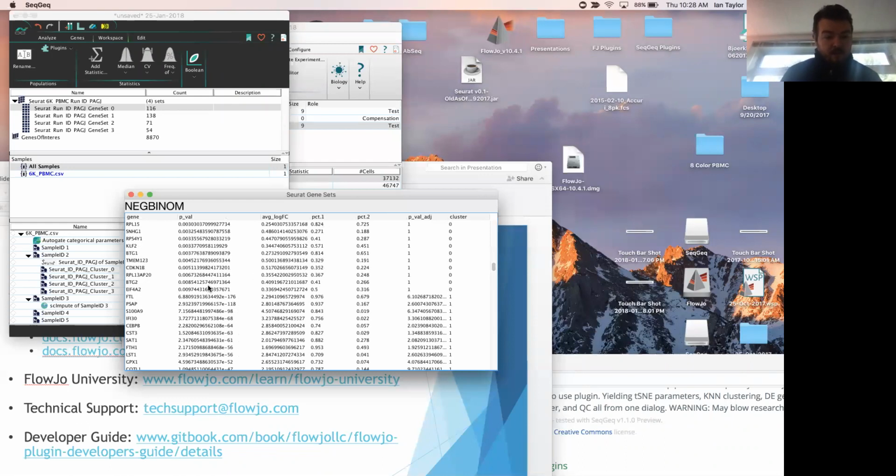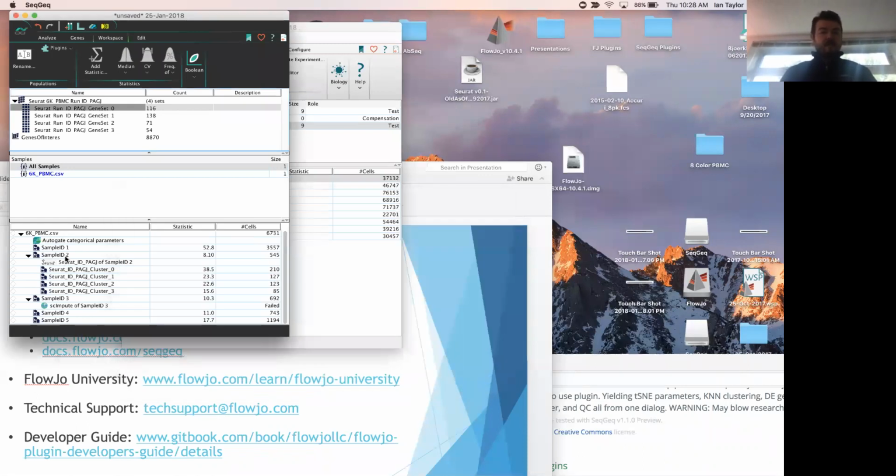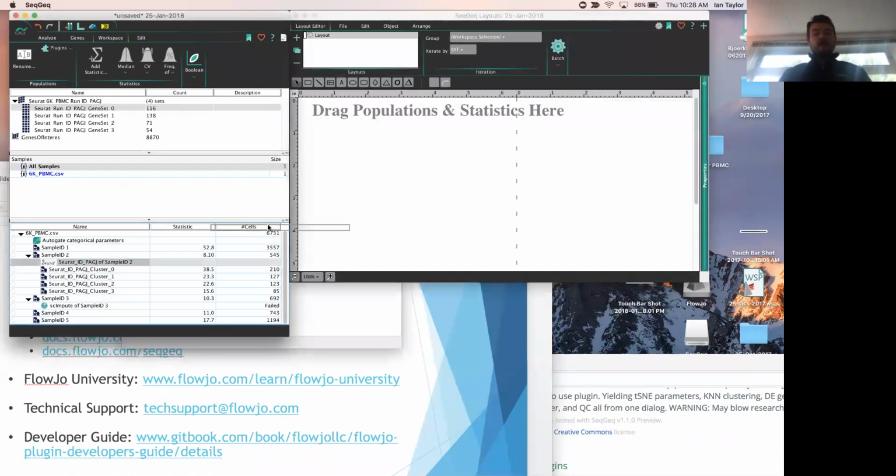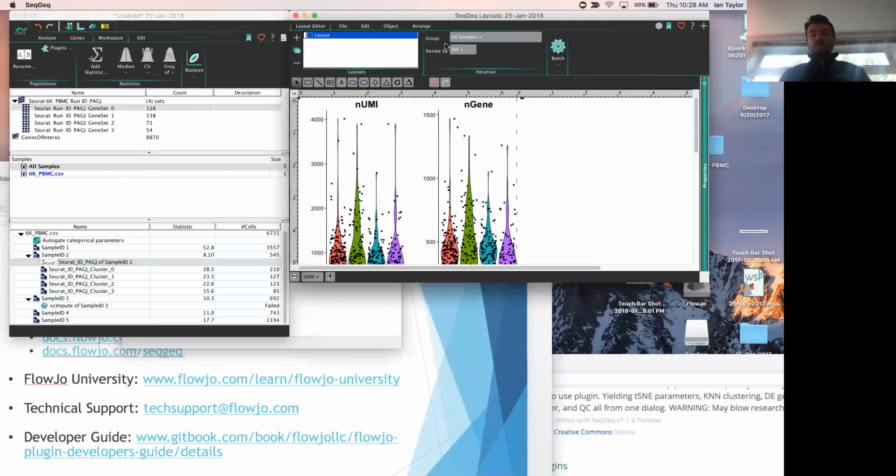The largest of which is 0.0097, in case you're curious. Once that's calculated, it's actually got a PNG image along with it, which can be added to the layout editor simply by dragging the plugin into an open layout like so.